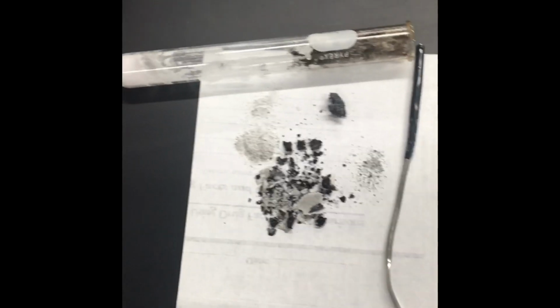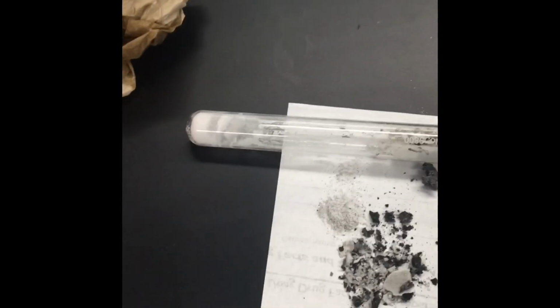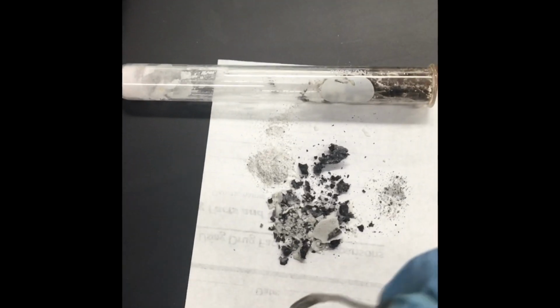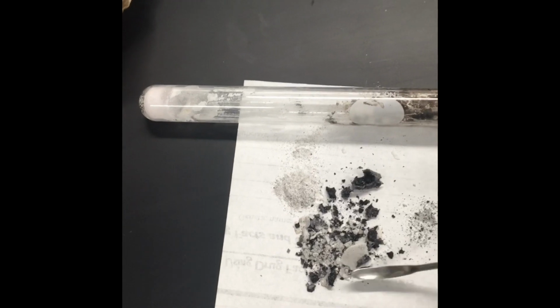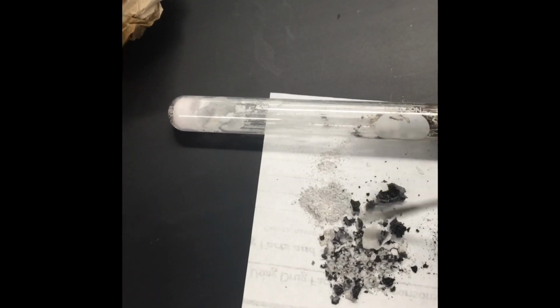This is what I did yesterday, was another gummy bear, and poor gummy bear. So what we have right here is all this black. This is carbon that was left from that gummy bear. Remember, sugar has carbon, hydrogen, and oxygen. And that carbon was left over, a little bit. This white is just the potassium chloride that was made.